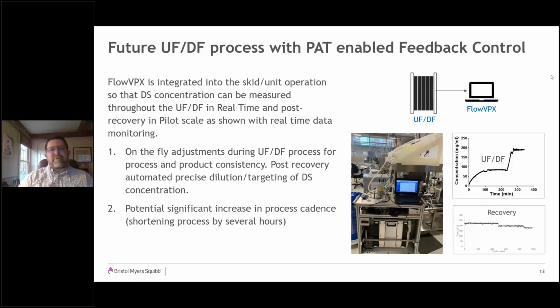Because, like I said, these are separate operations, and you don't want cross-contamination. So you would switch to a different flow cell, probably a smaller one because it would be in a loop with a pump. We have done these experiments, and other companies have done these experiments. So basically, it's a way of measuring something inline that's in a bag or a vessel.